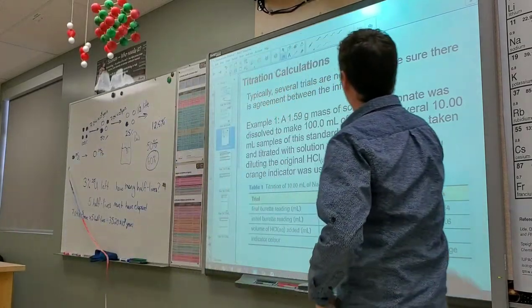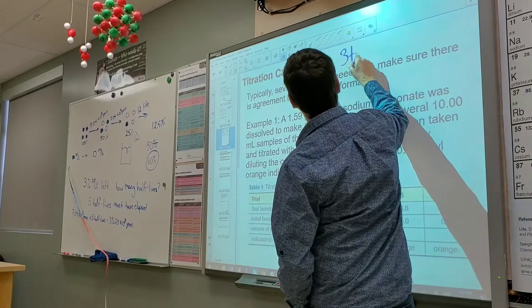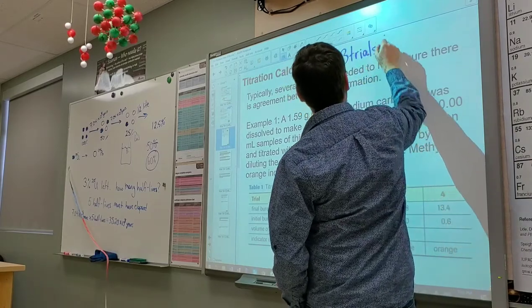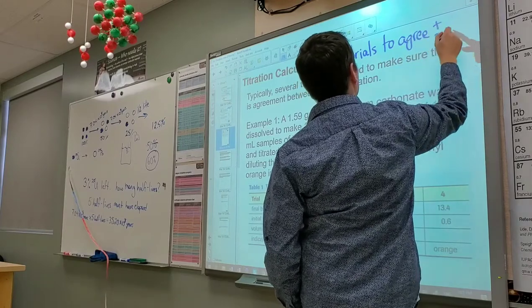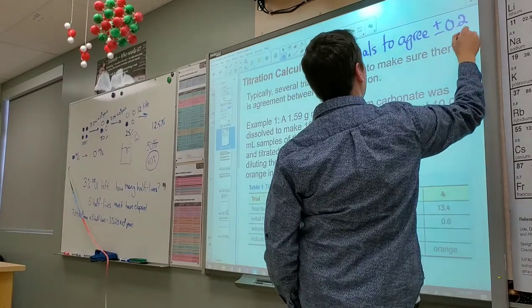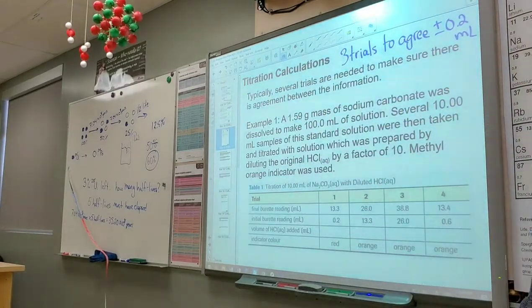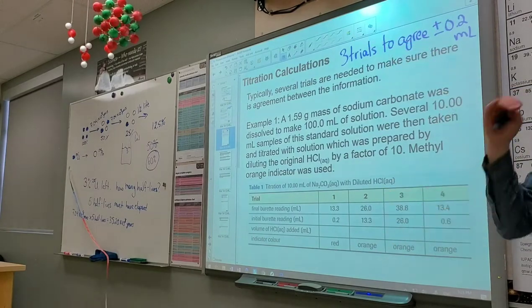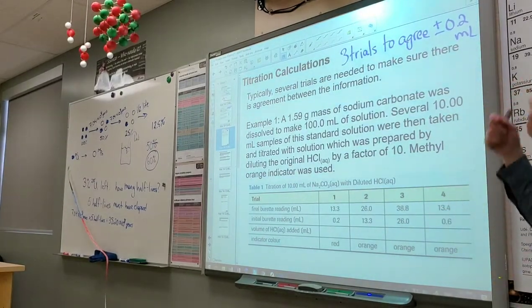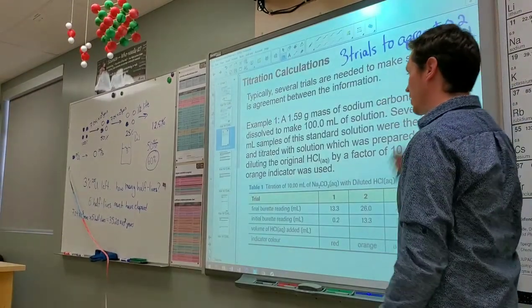I need you to write this down. We need 3 trials to agree plus or minus 0.2 milliliters. What that means is your highest value and your lowest value have to be within 0.2. They can't be further than 0.2 of each other.